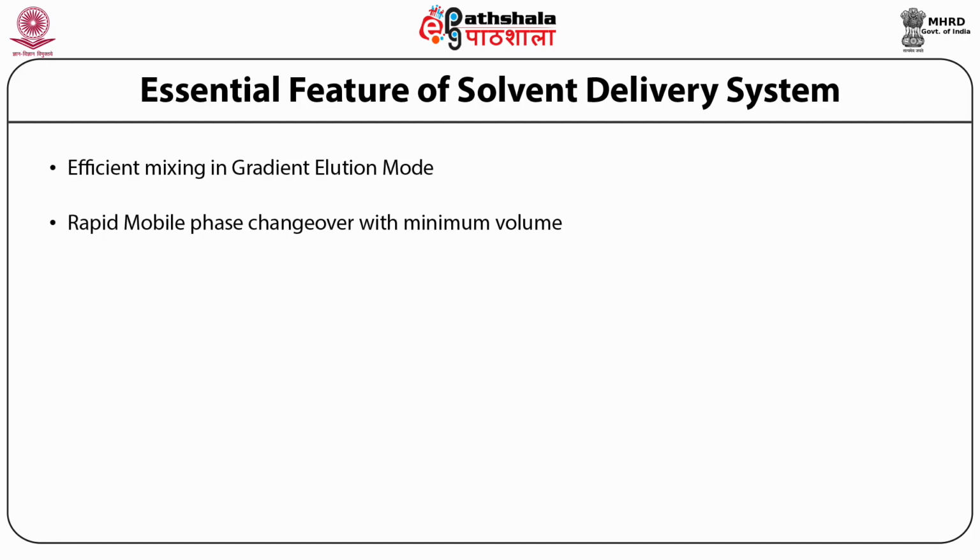In gradient elution mode, the volume or time required for the gradient to pass through the HPLC system is known as system volume. In a chromatographic process that employs a mixture of two solvents as the mobile phase, initially, both the solvents are discharged from the reservoirs separately and are mixed in a desired ratio before the mixture enters the column.